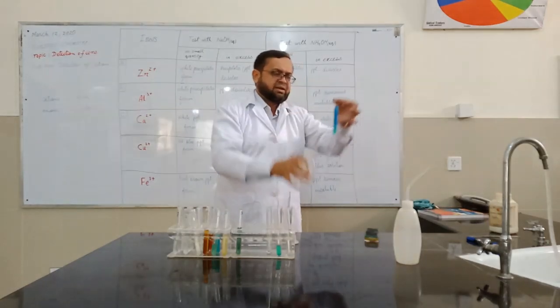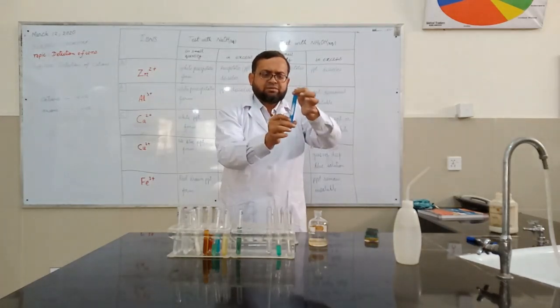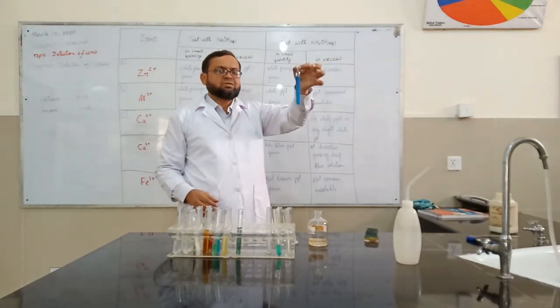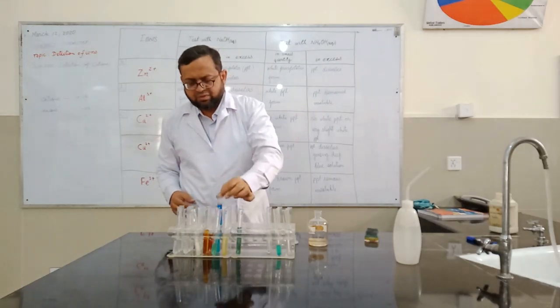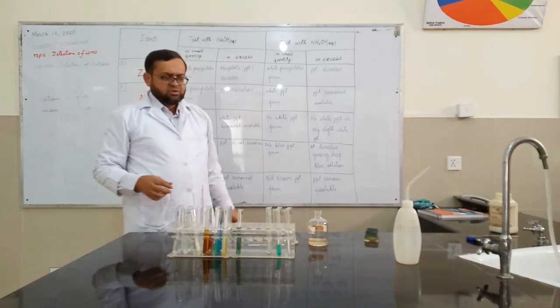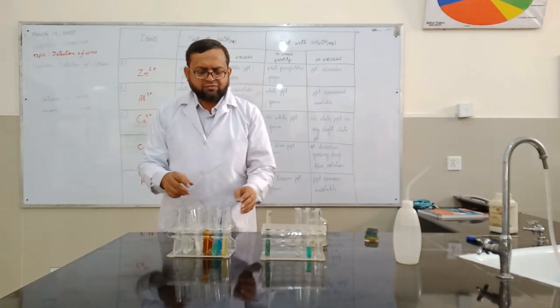See here, in excess the solution becomes darker. It means it is a deep blue coloration on excess of ammonium hydroxide. And see this here, deep blue coloration.